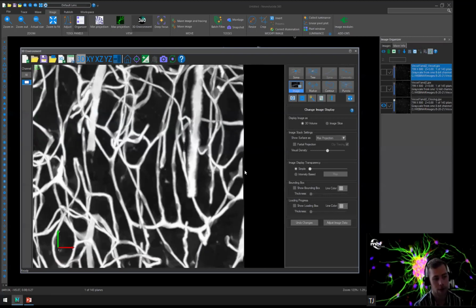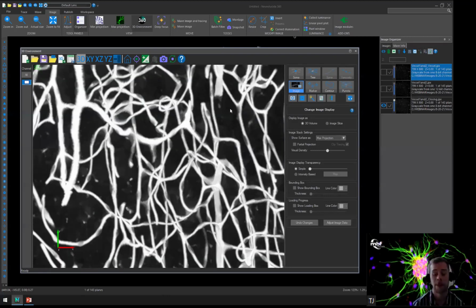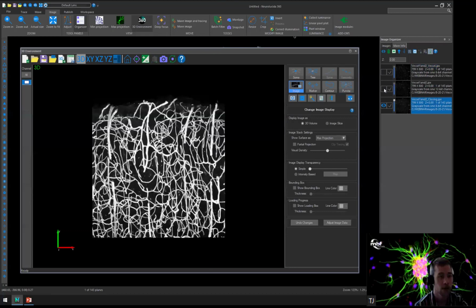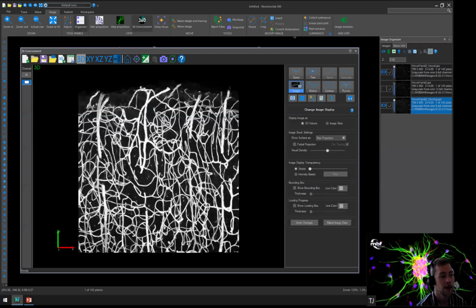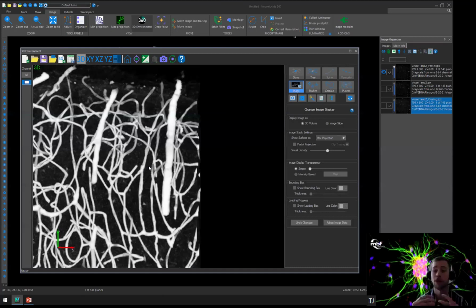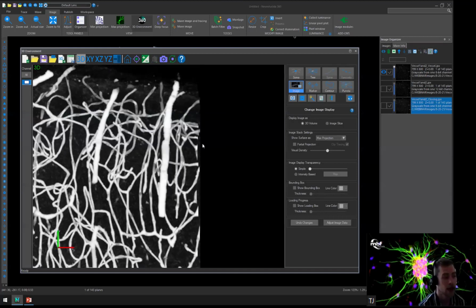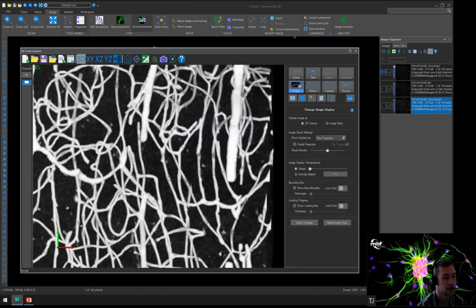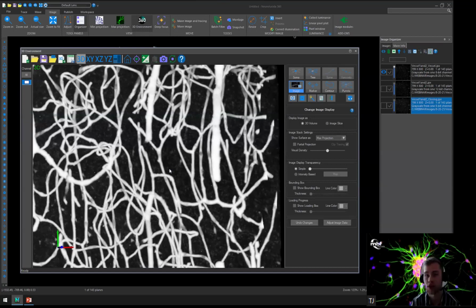And as we look through the image, there are some varicose spots that still remain. That's because we're not taking into account the edges, we're taking just the pixels themselves. So when we compare the closing filter to the vessel filter, I'm going to look at this spot in particular, we can see that the edges are nice and sharp now. The staining has made its way prominently throughout the whole vessel. And as we look through the remainder of the vasculature, a lot of those varicose spots have started to fill in much more uniformly to create a nice filled staining for the algorithms to follow.